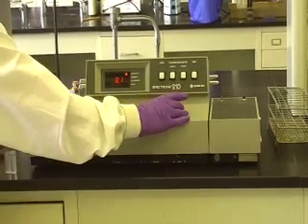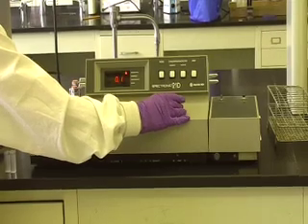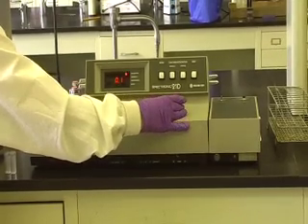Set the wavelength with the Wavelength Selector, the large knob on the right. The dial to the left of the knob displays the wavelength.